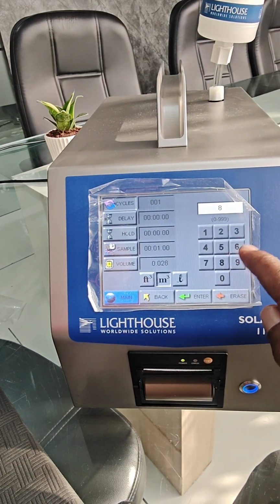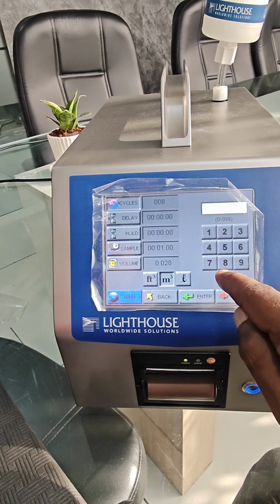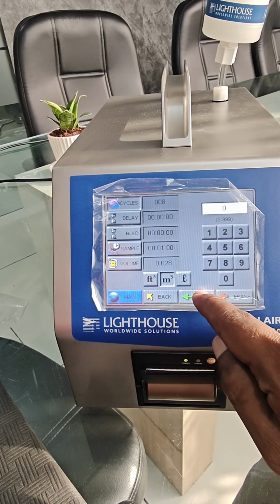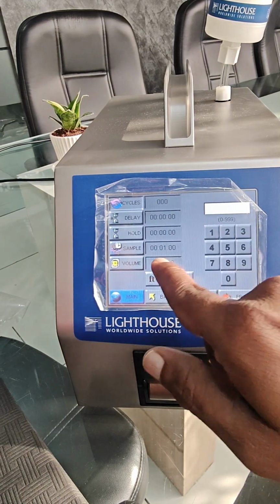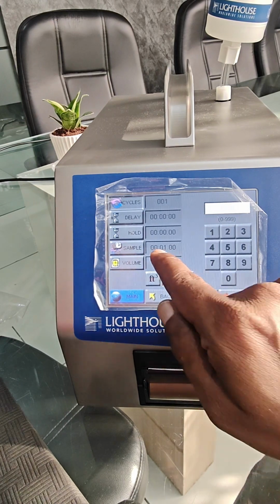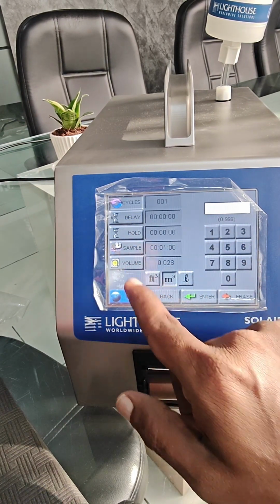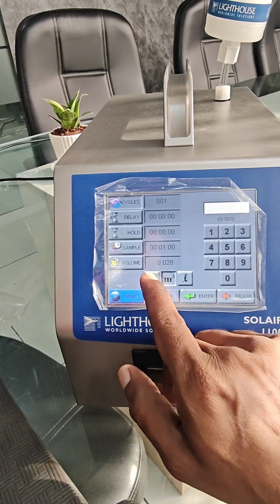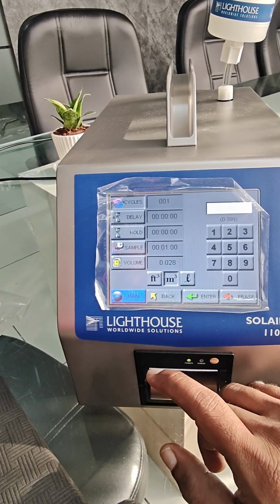If you want to press 8, you can have 8 cycles, or if you want to press 0, it does unlimited samplings, and you have to manually stop the instrument. I will select enter. This is delay, hold, sample time, and volume you can change in feet cube, meter cube and liter also.